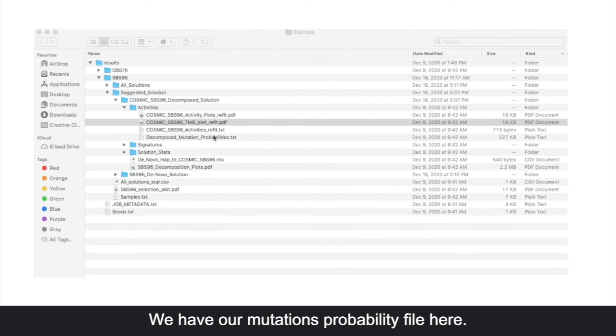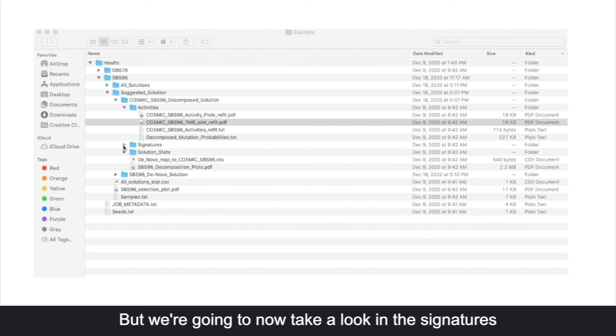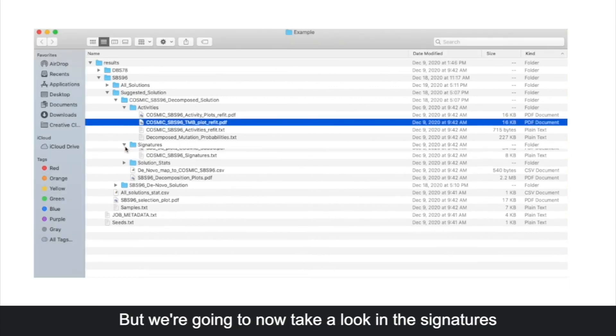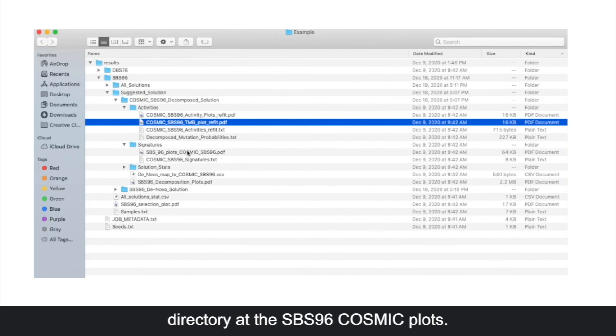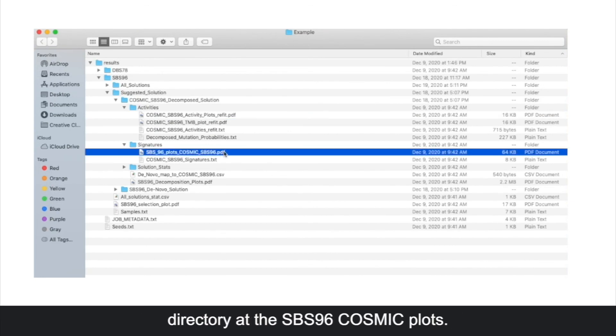We have our mutations probability file here. But we're going to now take a look in the signatures directory at the sbs96 cosmic plots.